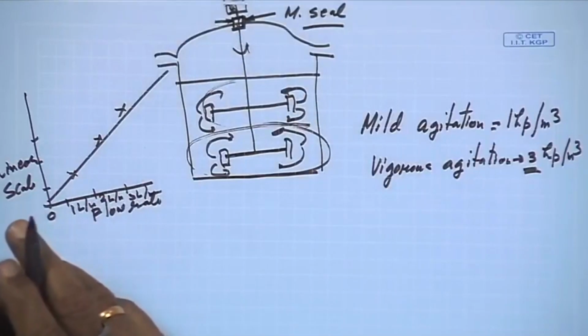at high pressure. Now when we pass the antifoam oil at high pressure, it maintains a kind of positive pressure inside this mechanical seal. If there is a positive pressure inside the mechanical seal, what will happen? There is less possibility of air entering the system, and this is how we can maintain the sterility of the process. The main purpose of passing this oil is to lubricate the shaft. If we lubricate the shaft, then the frictional force will be reduced, and if the frictional force is reduced, then the heat generation also will be reduced to a great extent.